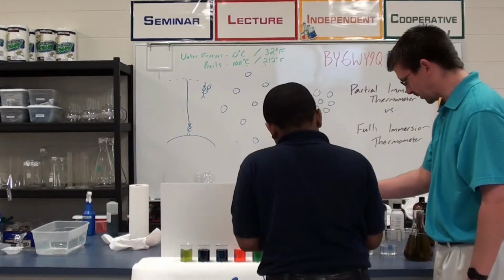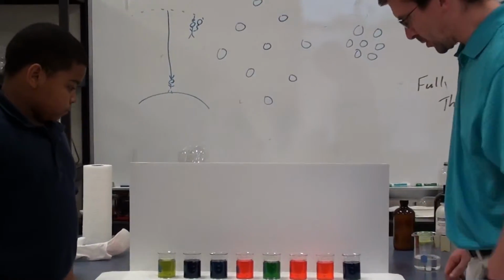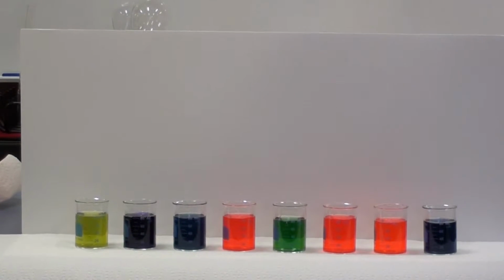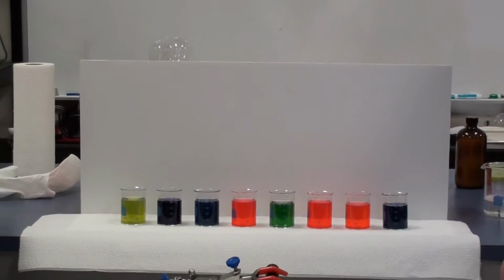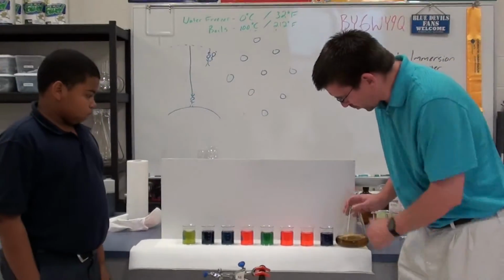All right, we'll slip the rest of that over here. So what we have, now some of them are pretty close to the same color, but we've got shades of green, kind of a yellowish over there, yellowish green. And of course we've got our color we started out with here, blues, purples.